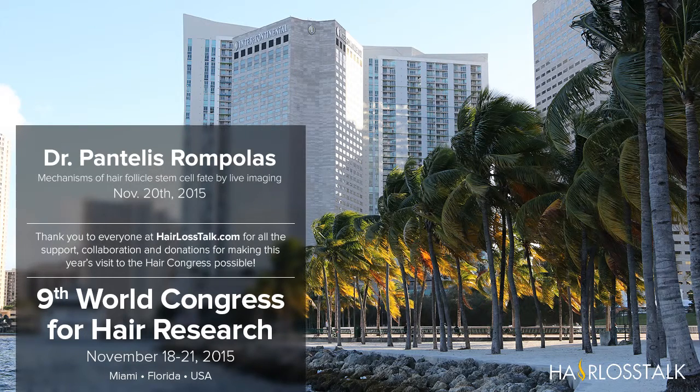In this example here, you see a cell in the lower part of the hair germ, and during the anagen phase, this cell produces a lineage, which is, in this case, a fully differentiated lineage of the hair shaft. And now we can also determine what is the fate of that lineage at the end of the hair cycle.